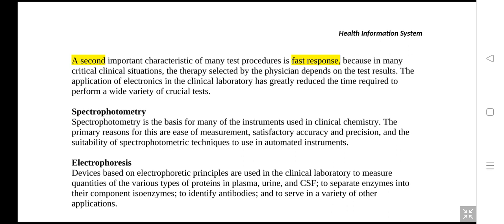This patient will bleed seriously. You are not giving those in the theater an opportunity to prepare for any eventuality, because you have already said that this is within range, but it's actually outside the range. When the patient starts bleeding, it will be a very disastrous case, running around the blood bank and so on. So it's important that we talk about accuracy and precision.